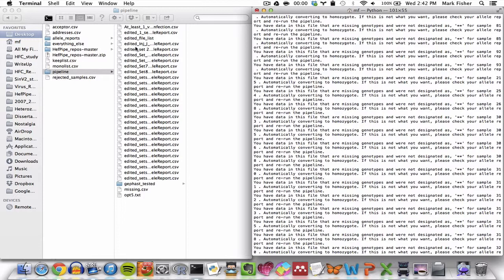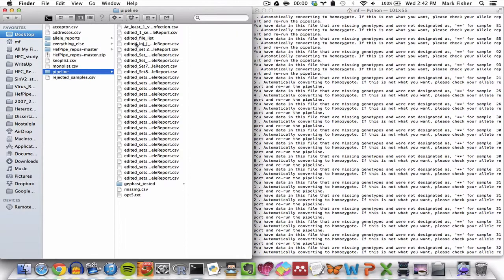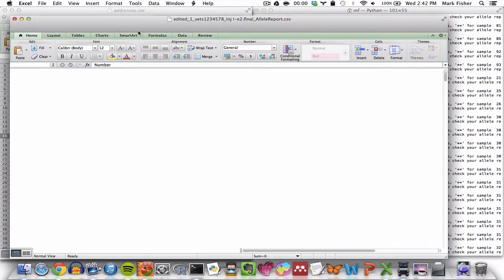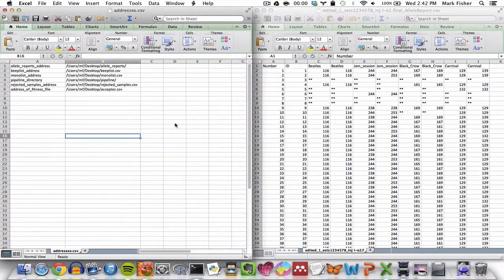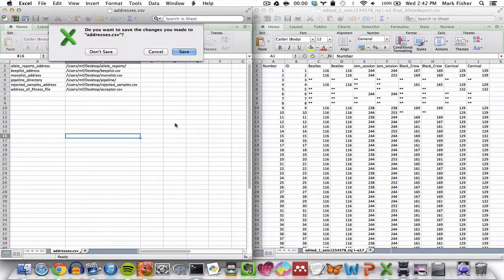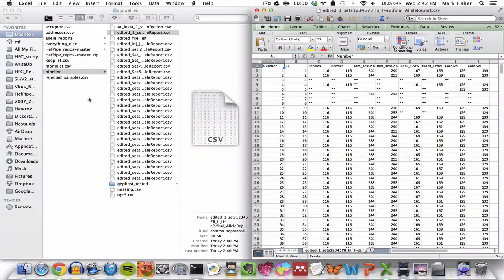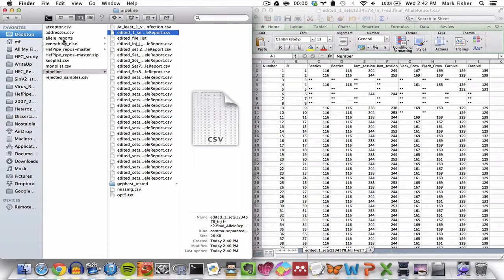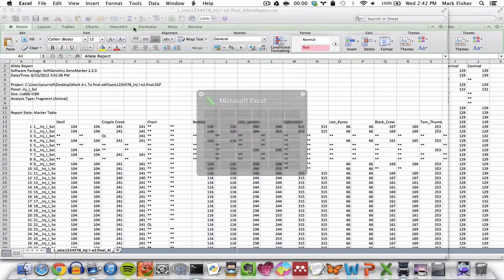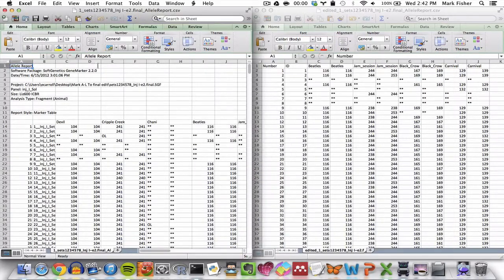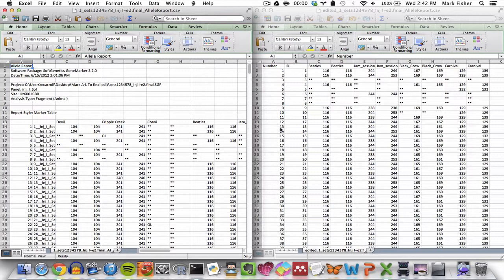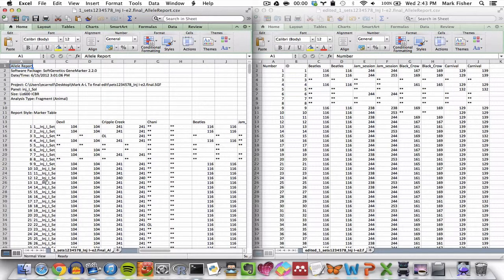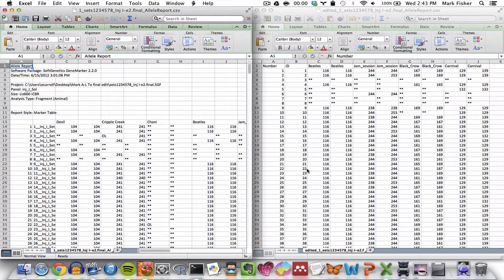So let's take a look at what an edited allele report looks like in comparison to an actual allele report. So on the right, we have the edited version and on the left, we have the unedited version. And you can see the edited version removes all the stuff in the first several rows. It also converts the sample names so that they're just containing the digits. So now they're IDs, they're just digit IDs. So it gets rid of everything beyond the first digit.